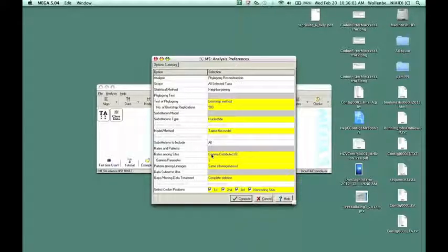Here is where you set your analysis parameters for the neighbor joining tree. Going down the list, the first parameter you will need to change is Test of Phylogeny. This option is where you choose whether or not to perform a bootstrap analysis. Because the neighbor joining method has no inherent clade support measure, you will always need to perform a neighbor joining bootstrap analysis. Typically, 500 replicates should be sufficient to get a good estimate of how well your data support the groups in the final tree.